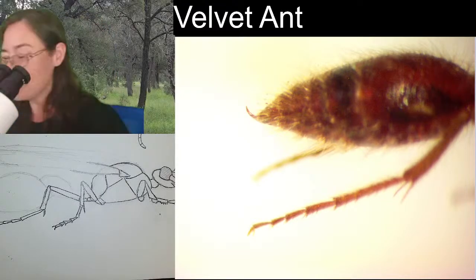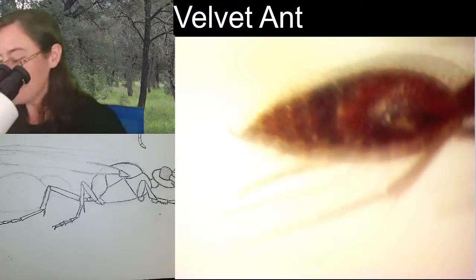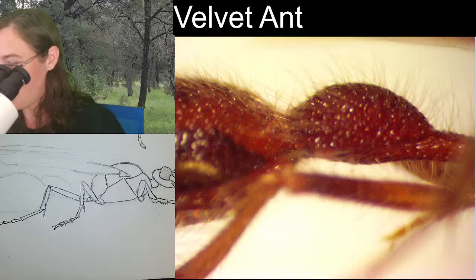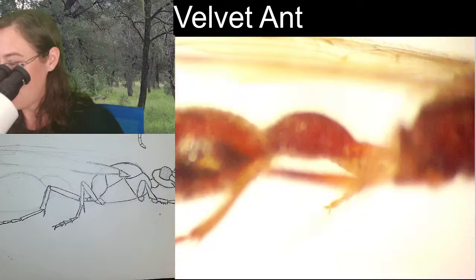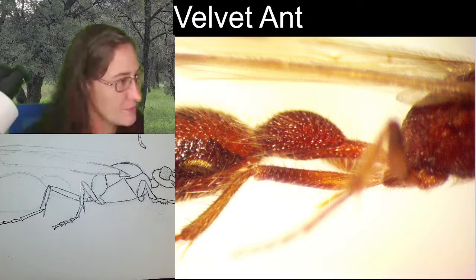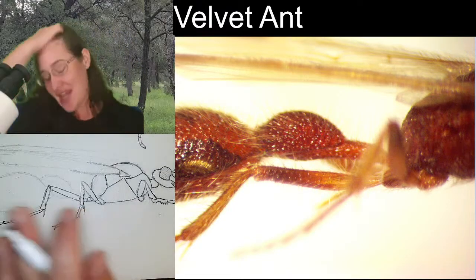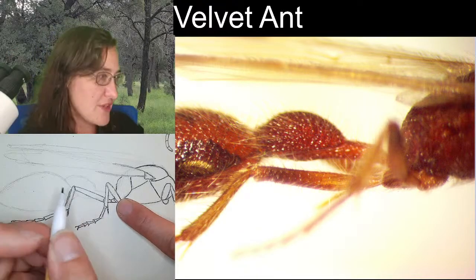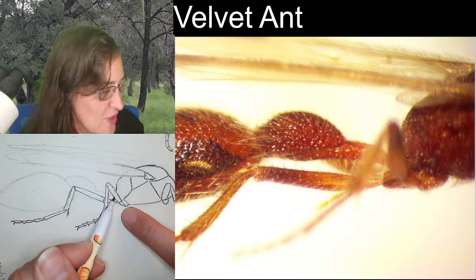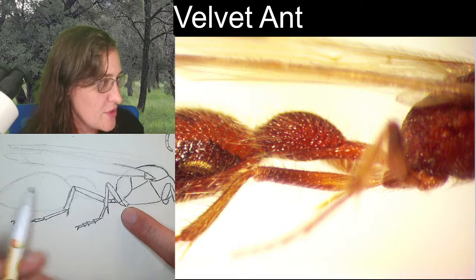And we're going to check out this abdomen, or this metasoma. Look how fluffy! Fluffy, fluff, fluff, fluff. I'm so happy. Okay. Alright, so this stem right here is coming out from in between the hind legs of our velvet ant. It connects right here and it rounds up and out.